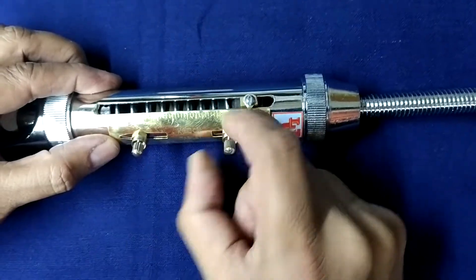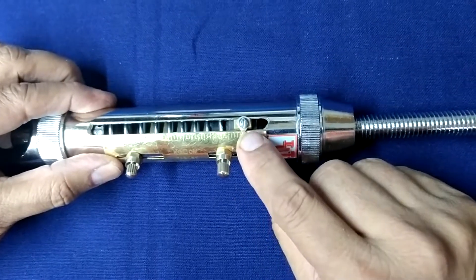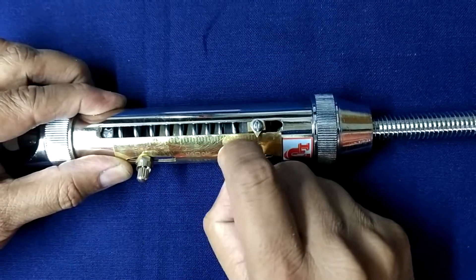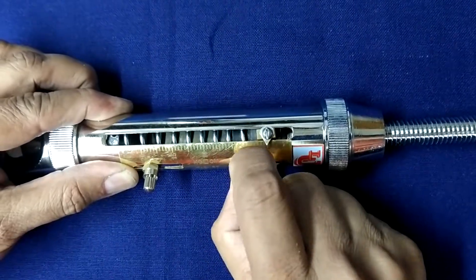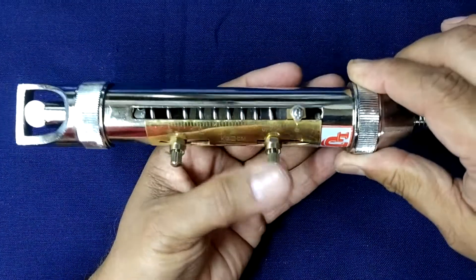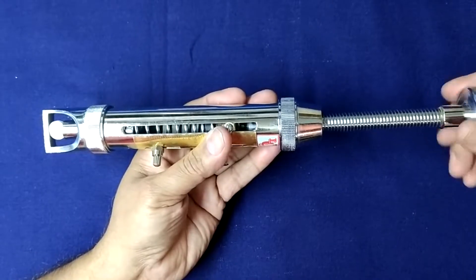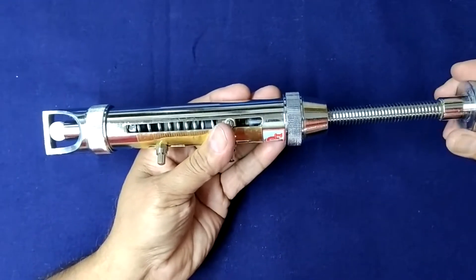Now adjust your scale to the 0 mark. Loosen these screws and set your scale to the 0 mark. Then it forces the tablet. Adjust your scale — here we go.